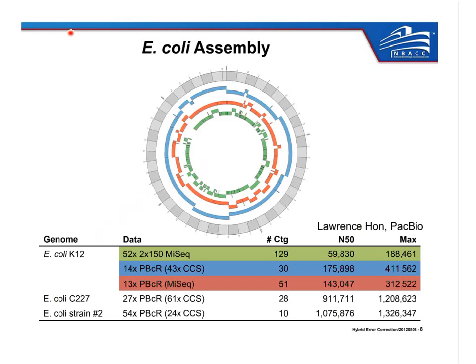So our goal for the bacterial genomes is to do automated closure. Typically closing a bacterial genome, even relatively simple ones like an E. coli K12, is very manual, very slow, and very expensive. So we want to address that and do it in an automatic and repeatable fashion.